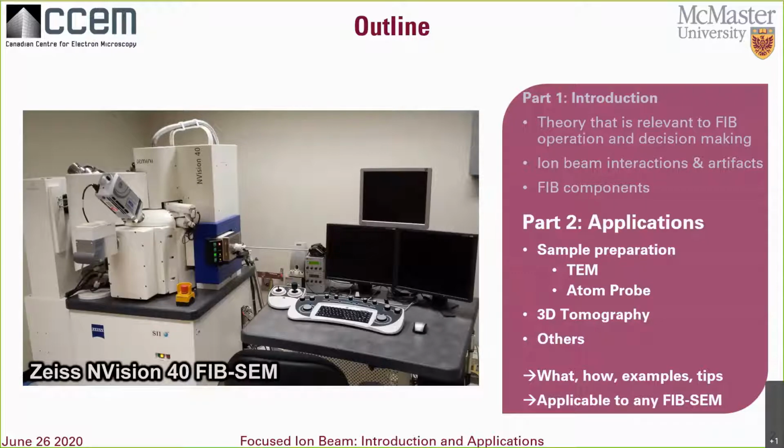I'm trying to be brand neutral here, so this presentation can apply to any FIB operator. This means I'm not getting into optimizing for specific FIB models, but as a user, keep in mind you should adjust your methods to the designs and quirks of the particular microscope that you're using.